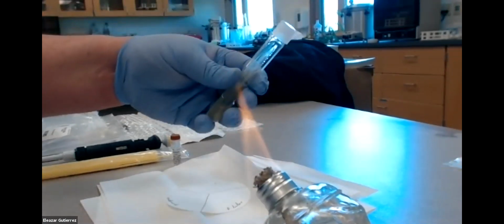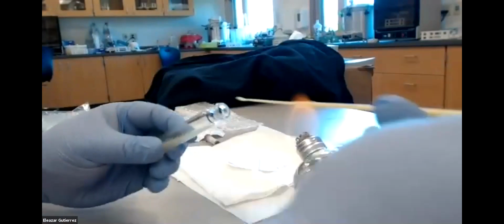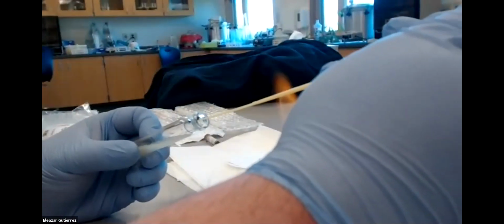And that's so I can grab my slant. Here's my slant. And just as I was demonstrating before, let me move this out of the way a little bit. With the back of my hand, I'm going to grab that cap, like so. I'm going to twist it. I'm going to flame it.